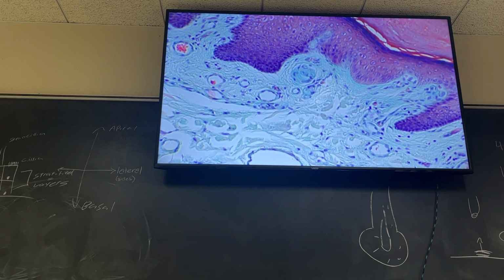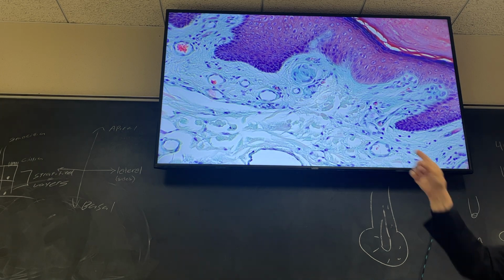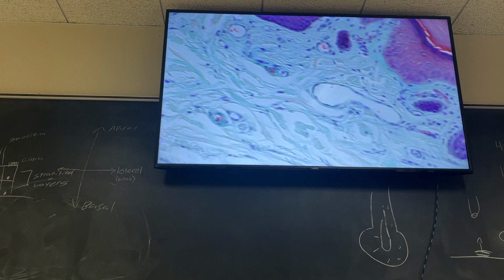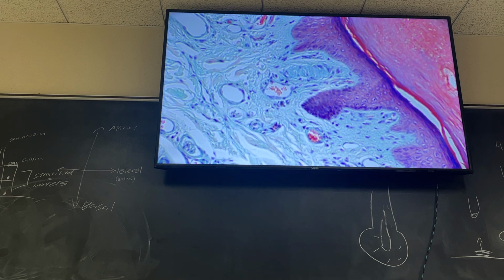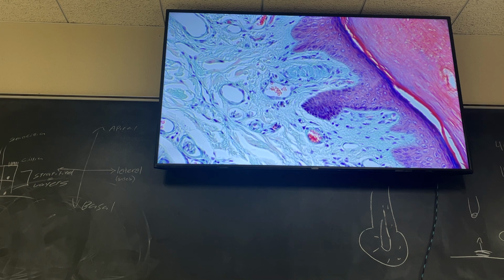There's one there. It's kind of a weird one. That was kind of round, doesn't it? See that one? Kind of round looking. That's probably because it's not cut clean. There's another good one in here. Let's see. Where's a good one? There's a nice one. How about that one? That's a nice one. Want to see that one? Right? Very distinctive look to them. Okay. Any questions on that? All right, let's go on to the next one.